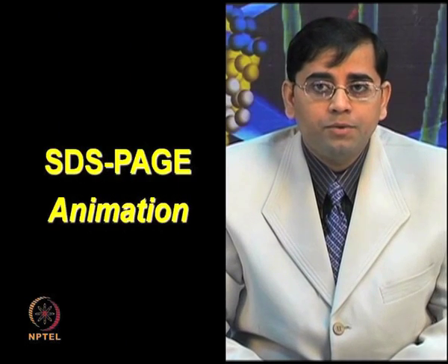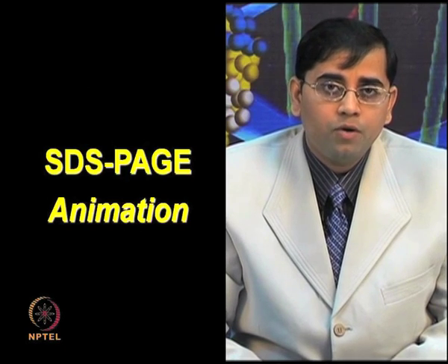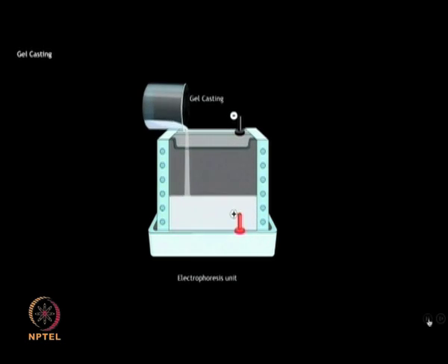I will now describe the animation and show you the steps involved in SDS-PAGE. Sodium dodecyl sulfate polyacrylamide gel electrophoresis, SDS-PAGE. In this animation you will see various steps involved in separating proteins based on their molecular weight.